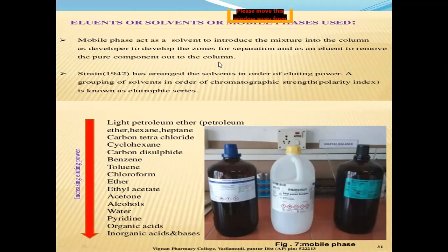What does the mobile phase do? The mobile phase facilitates the proper separation of components on the stationary phase, and it also takes out the components, eluting them one after another.